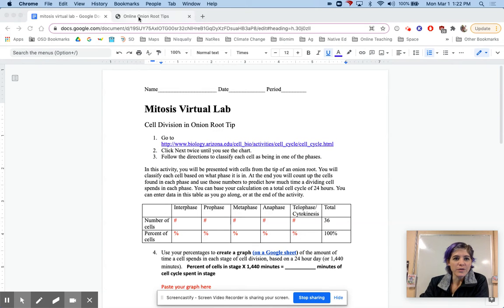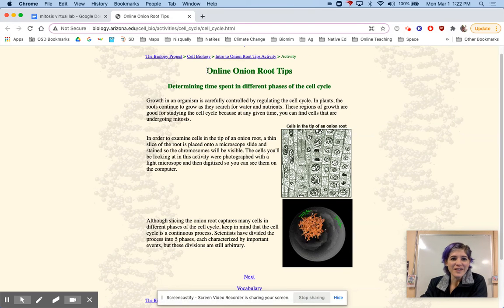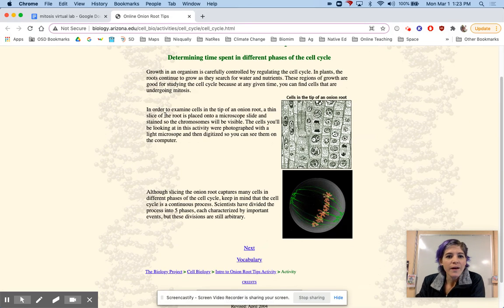When you click this link, it'll take you here to Arizona.edu. And this is one of the classic virtual labs that's been around for a while. So imagine this is the slide, this little box here that you're going to take a closer look at in a second.